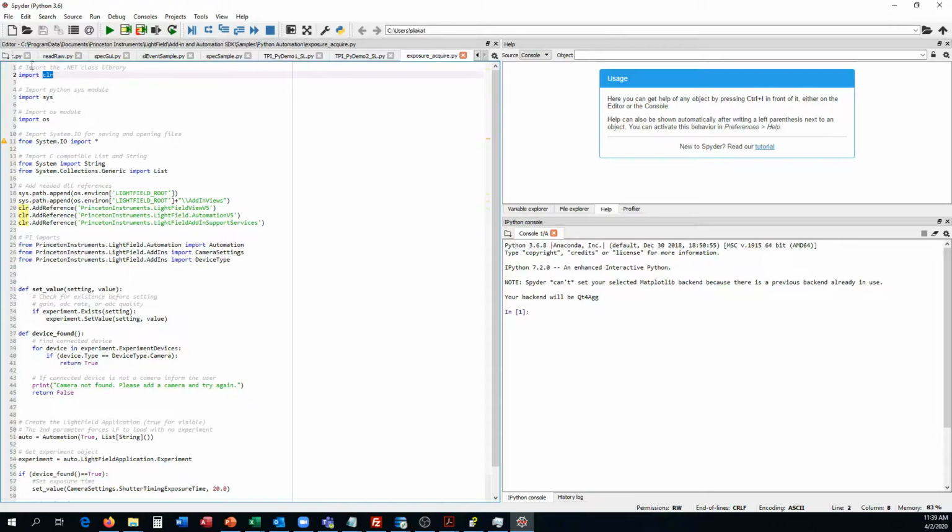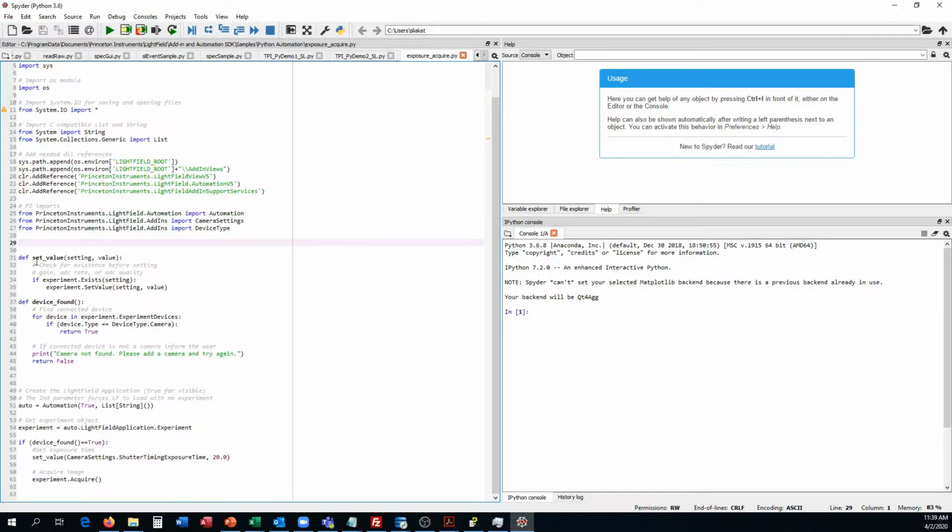If you get an error when you try to run automation scripts referring to the line that this import is on, then you know that there was a problem installing that. So that needs to be rectified. So past the declarations, let's go ahead and skip these function declarations and come back to them as they're called in the program.